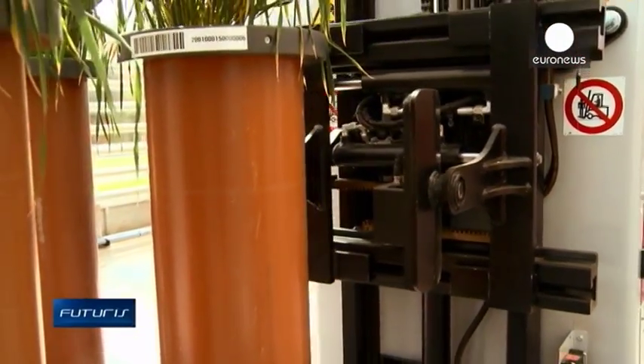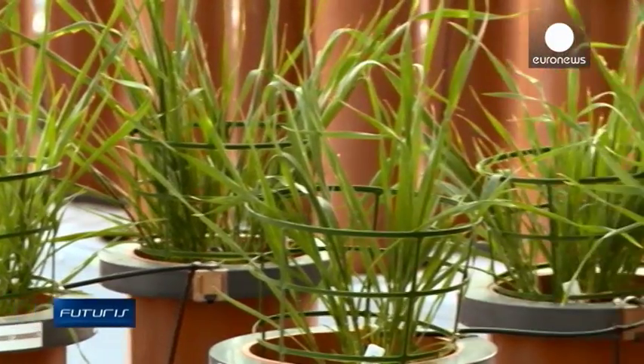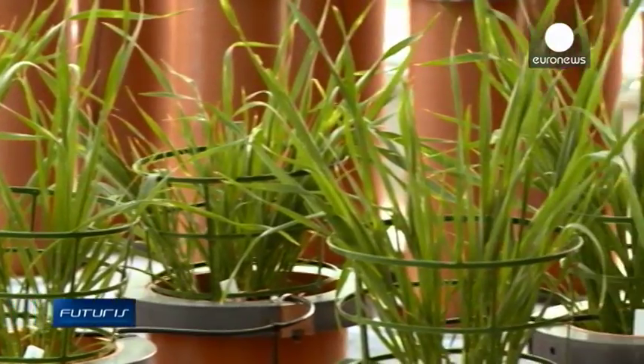For 10,000 years we bred crops by looking at the above part of the plant. But we want to make plants more nutrient use efficient, water use efficient, and that requires us to actually really look at the way the roots grow. So we want to uncover the hidden half.